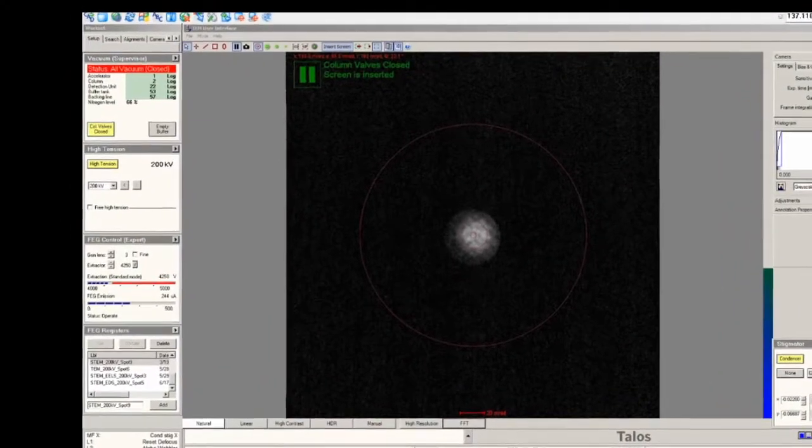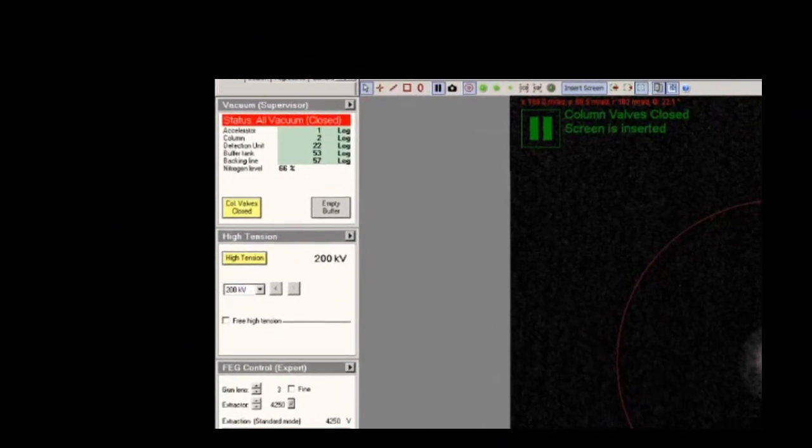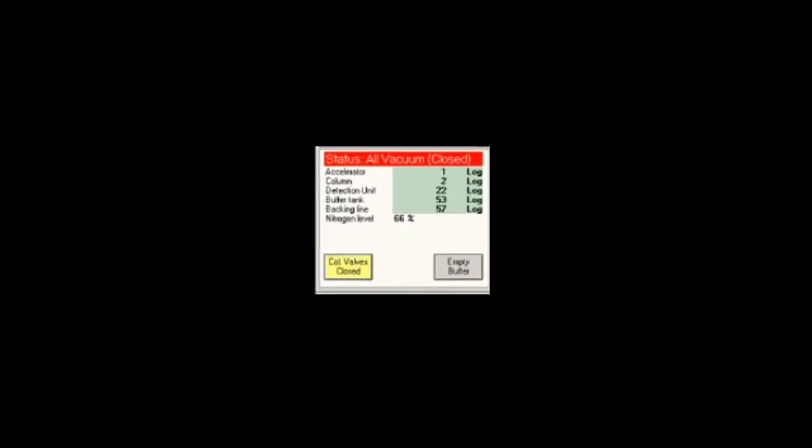When you first arrive at the system you must check the vacuum panel. In particular, check that the column vacuum is less than 15 log. Also ensure that the nitrogen level is greater than 30%. The column valve should also be closed.